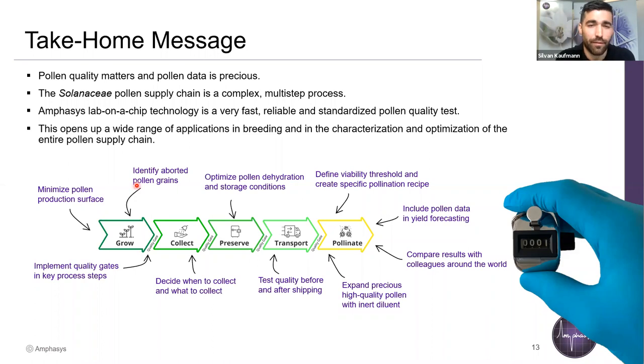And this technology is very fast. It allows you to operate at high throughput. And just to give you a bit of a feeling, measurement usually lasts 30 seconds to a minute, maybe. This is enough to measure several thousand pollen grains. And now I've been talking a little bit too long, I see, but in the duration of this talk, maybe 25 to 30 minutes, you could have measured already 1.5 million pollen grains on the single cell level. And for me, this is quite impressive.